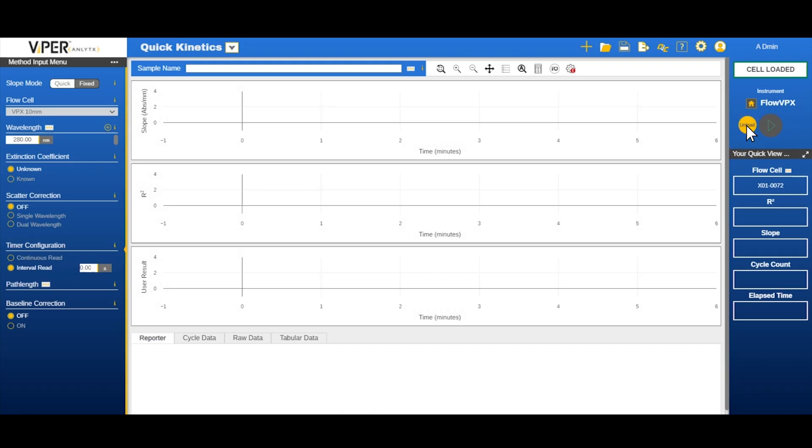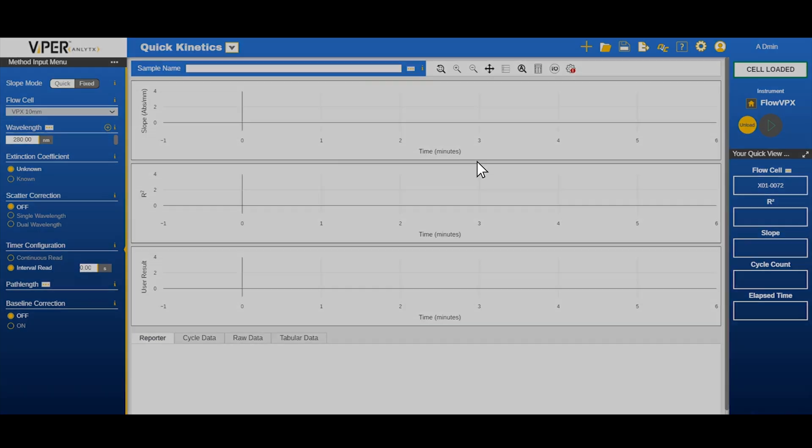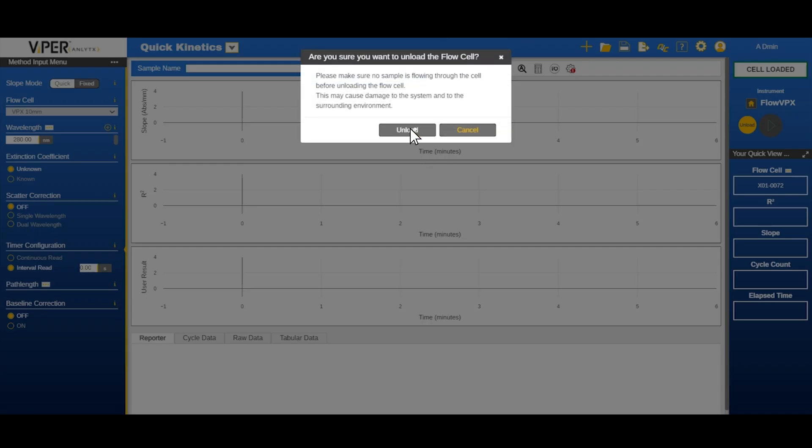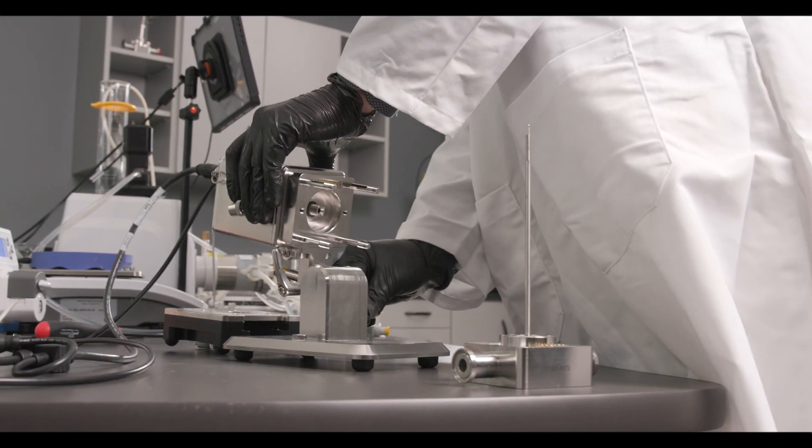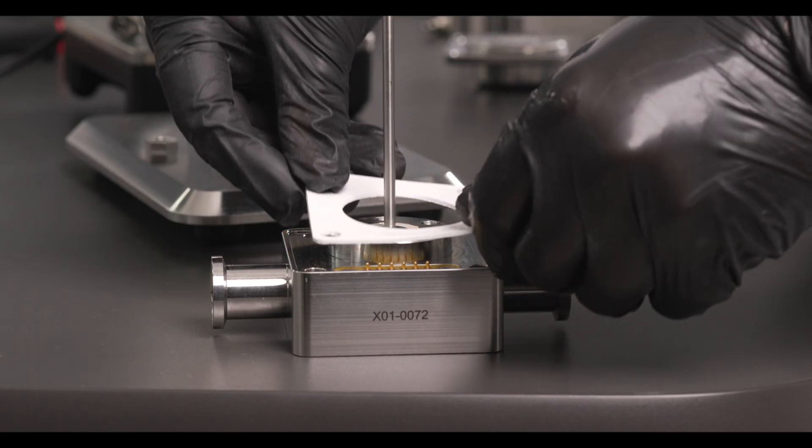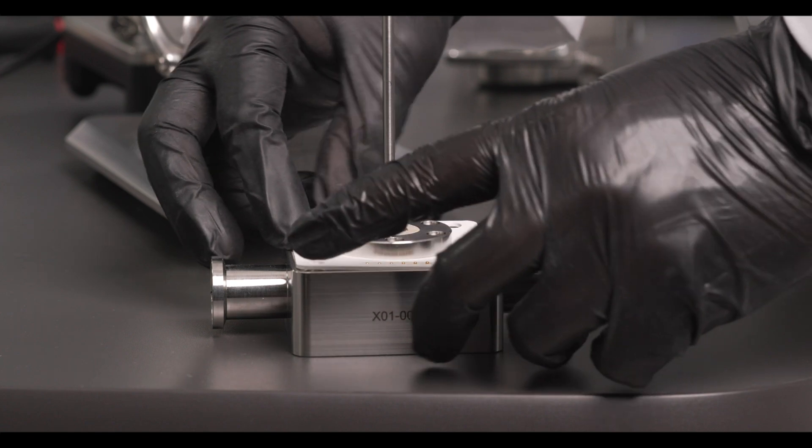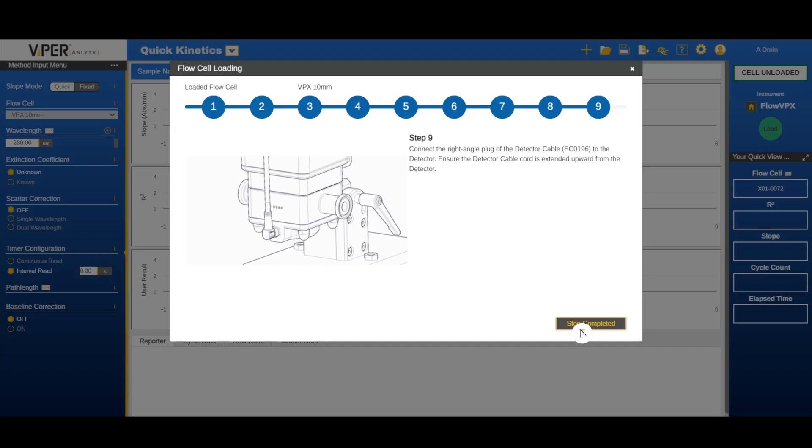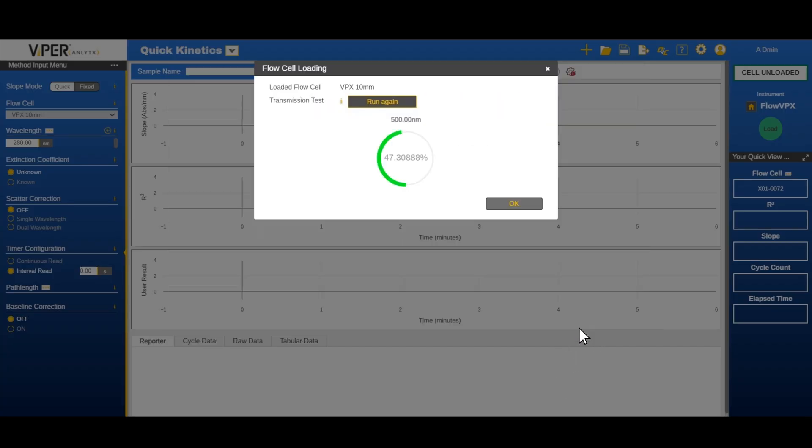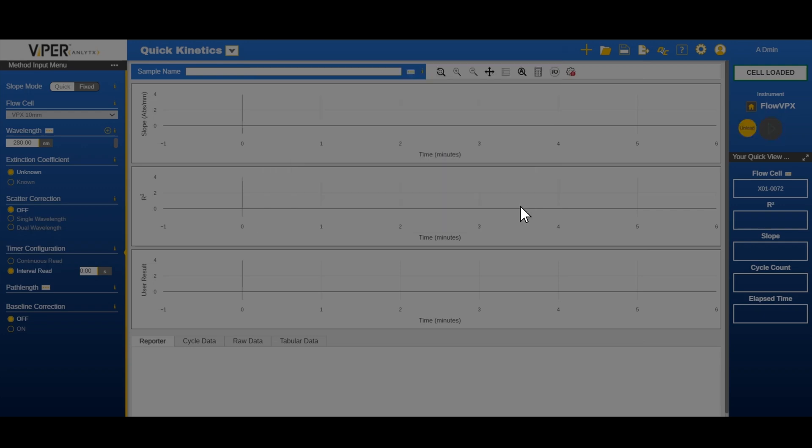If you are changing or disposing the current flow cell, begin the unloading procedure. For more complete instructions, consult the hardware manual or watch our video about loading and unloading the flow cell. Once the flow cell is unloaded, VIPER will automatically run a transmission check the next time you load a new flow cell.